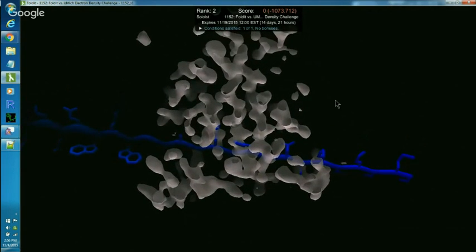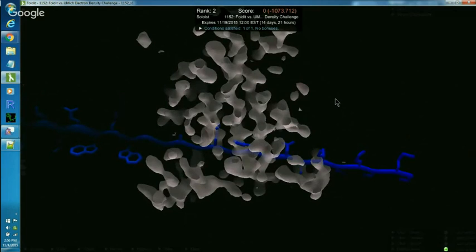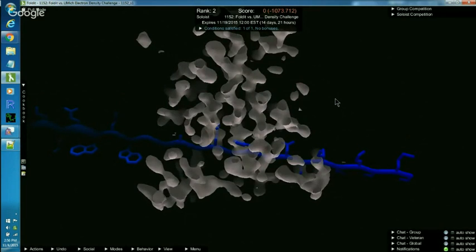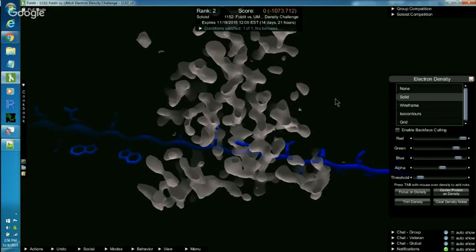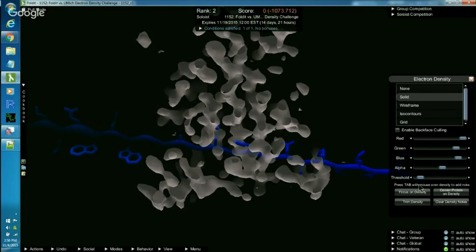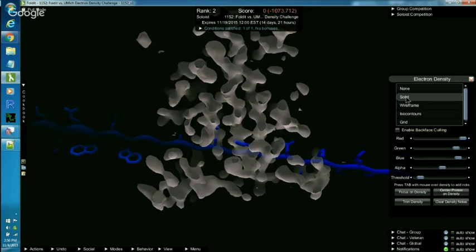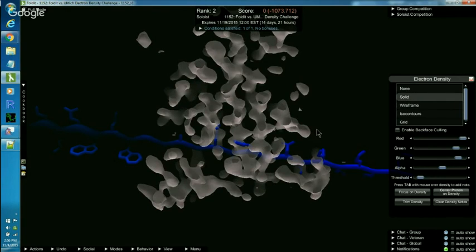Before we can mark those, we need to open the Electron Density menu, which is Shift-E for Electron Density. Let's just look at the settings on this. The threshold is the most important. I have my threshold set right above the M in mouse. I have my alpha, which is transparency, set a little to the right of the middle. And I'm using the solid Electron Density. Later, we'll use wireframe. Right now, we're using solid because I find that's easiest to see the backbone.